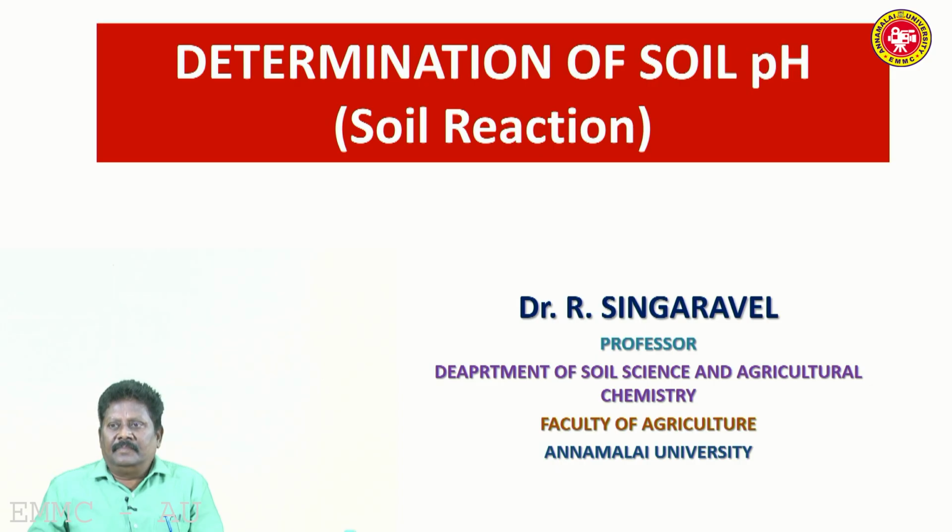Good morning. In this video, we will see the practicals determination of soil pH. Soil pH is otherwise called soil reaction. So, myself Dr. R. Singaravel, Professor, Department of Soil Science and Agricultural Chemistry, Annamalai University.